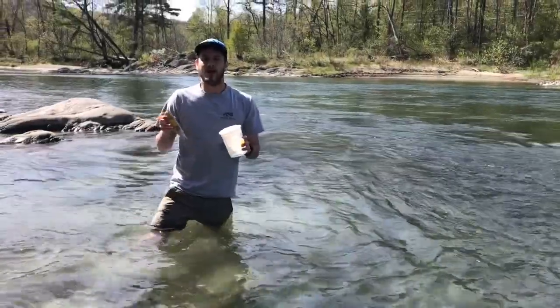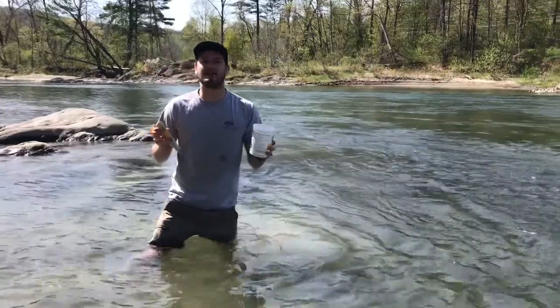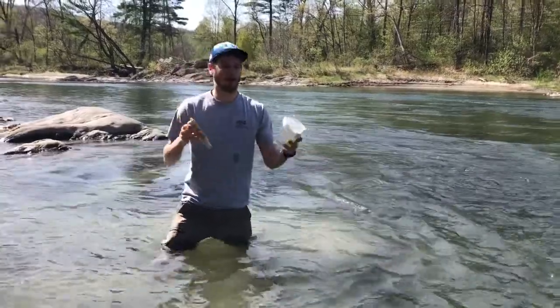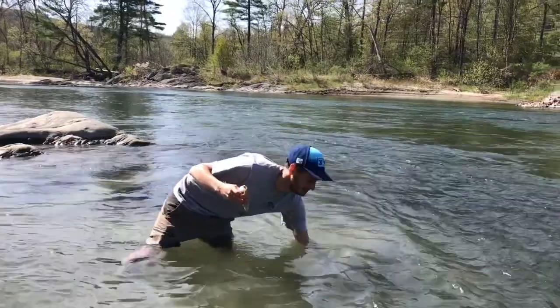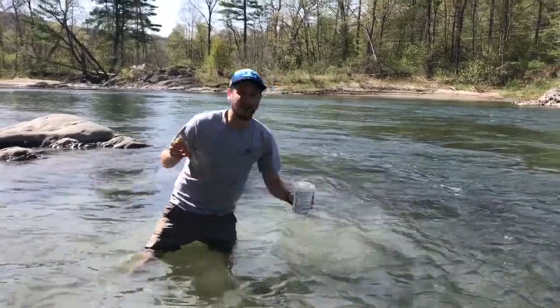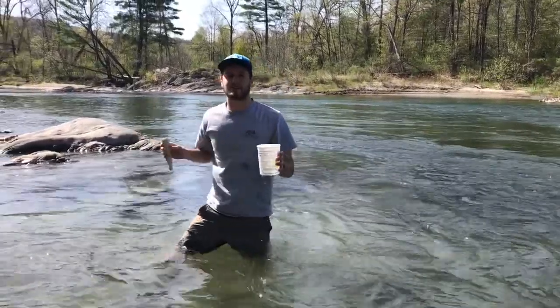Here I am in the water. I'm going to take a sample in the same way I'd take my E. coli sample. I'm going to place my yogurt container in the water about eight inches deep, fill it with water, and then bring it back to shore.